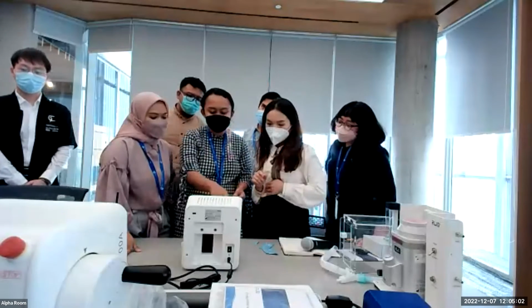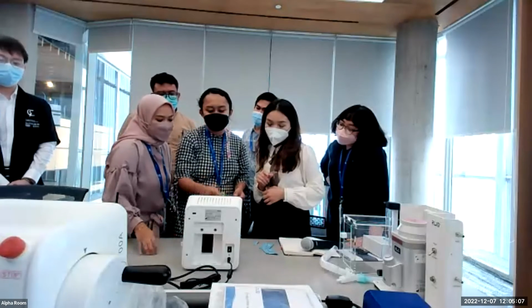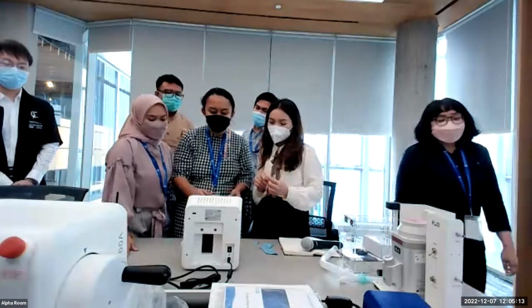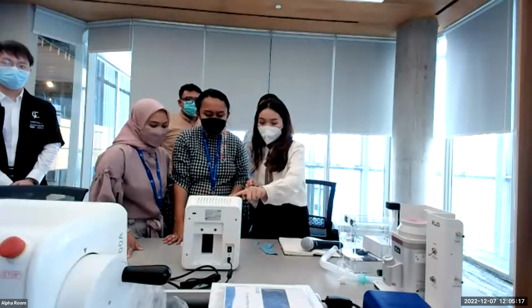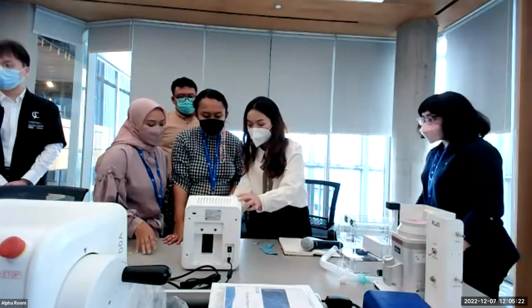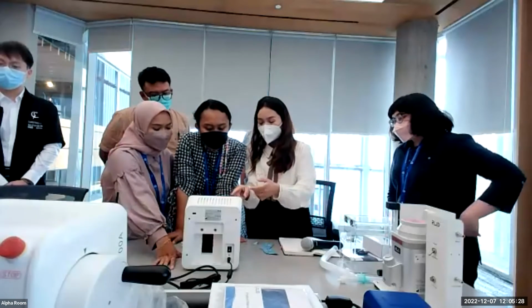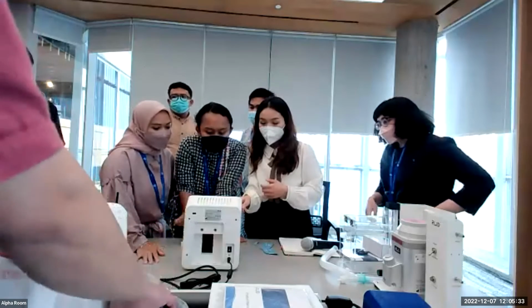Okay. Ini plus ini buat apa sih? Oh, nambah data ini profile name ya. Yeah, you can accept a program name here. Auto exposure for exposure. This one for when you count, to adjust the brightness. If you choose the autofocus one, then that can autofocus.